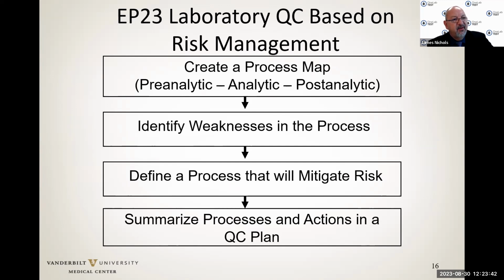We'll then determine a mitigation for those hazards, those weaknesses in our process. Maybe it's some type of a detection system. Maybe it's additional training of the operator to look for certain aspects of the specimen. And then we summarize those processes and actions in a quality control plan.